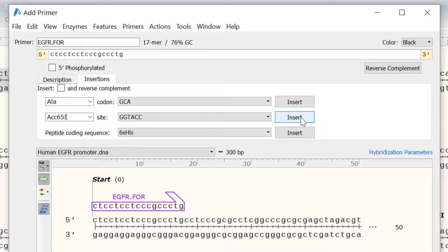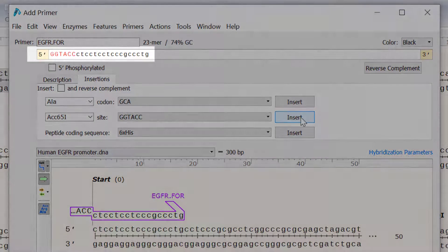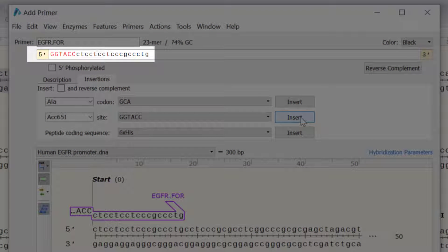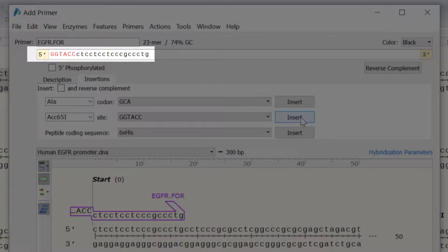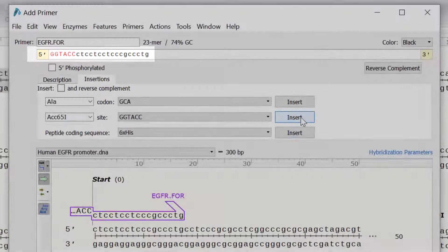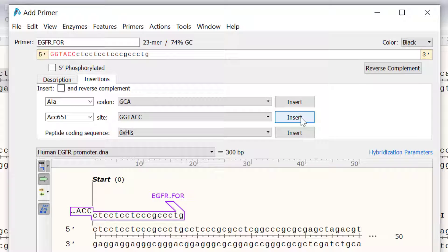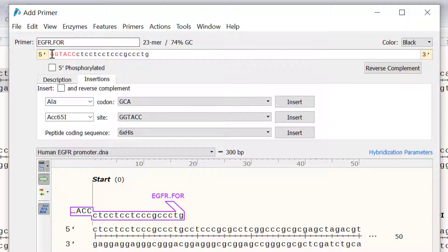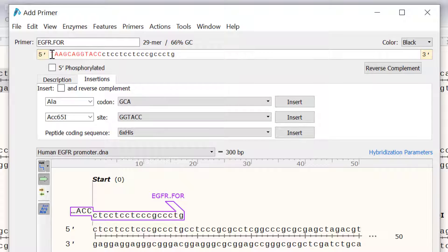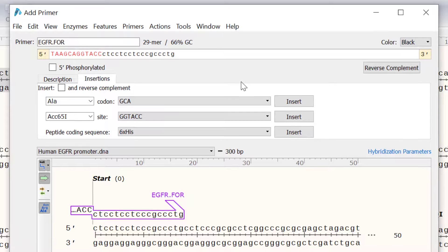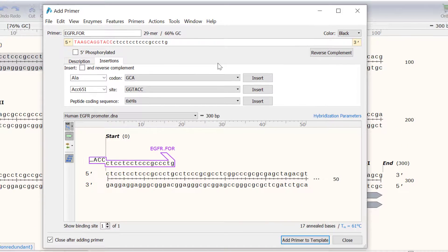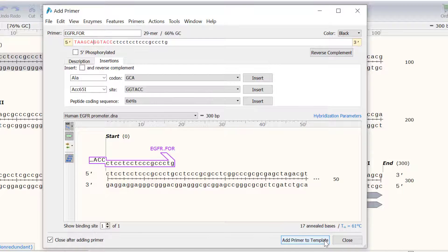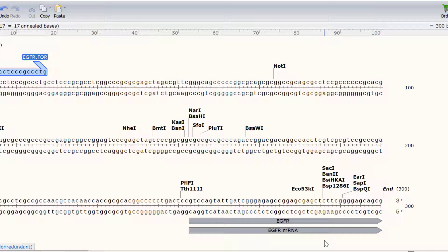Notice that the restriction site sequence has been added and can be identified by the red font. Since some restriction sites do not cut efficiently at the end of a linear piece of DNA, it is recommended to add up to 6 bases to improve cutting efficiency. So I will manually add the sequence TAAGCA at the 5' end. To save this primer I will click on the add primer to template button.